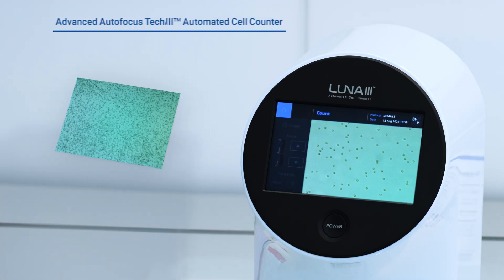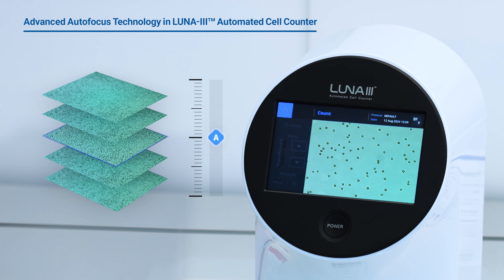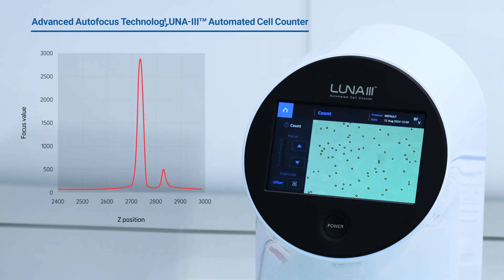The Luna 3 Automated Cell Counter features cutting-edge autofocus technology, delivering faster and more accurate cell counting. Its advanced autofocusing mechanisms and sophisticated algorithms guarantee consistent, reliable results, effectively minimizing any impact from focus deviations.